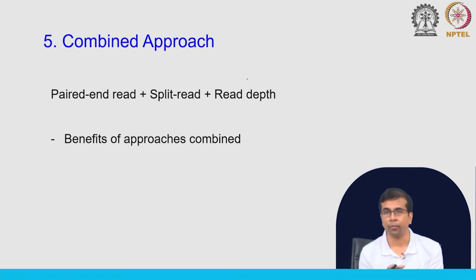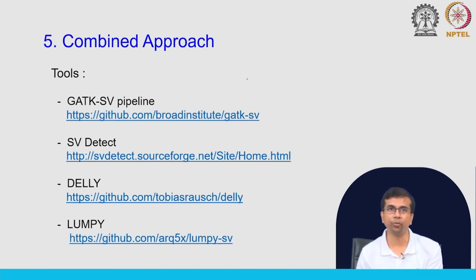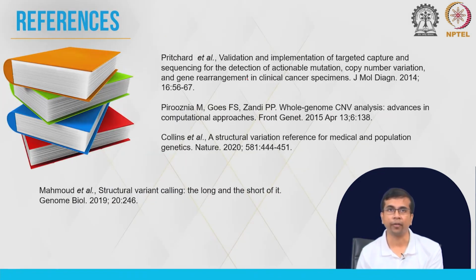Okay. So, when we combine these methods, we get the benefits of all these approaches, right, and we also get lower false positive calls. Okay. Here are some tools that actually implement this. They kind of take this combined approach, and they get much more accurate results.